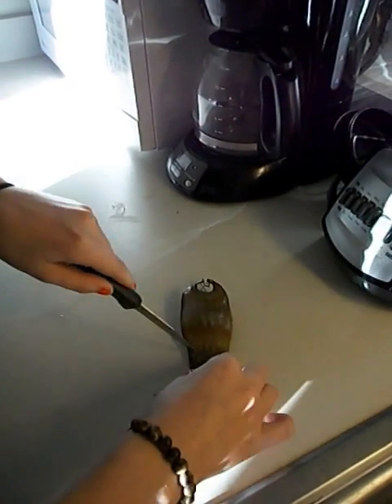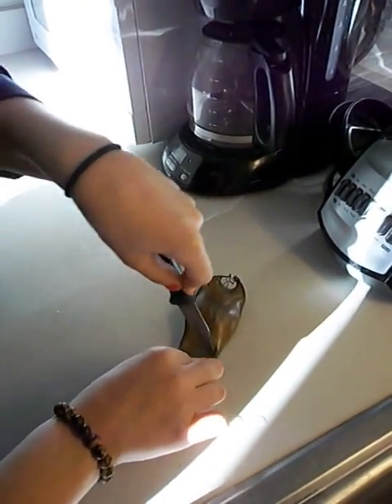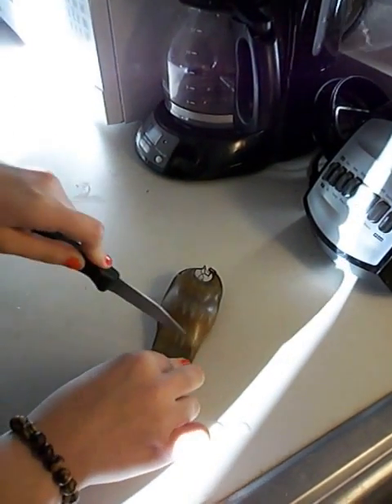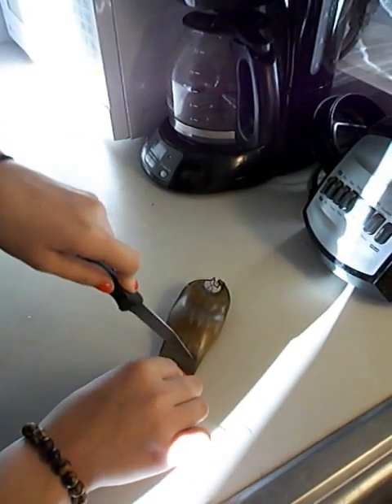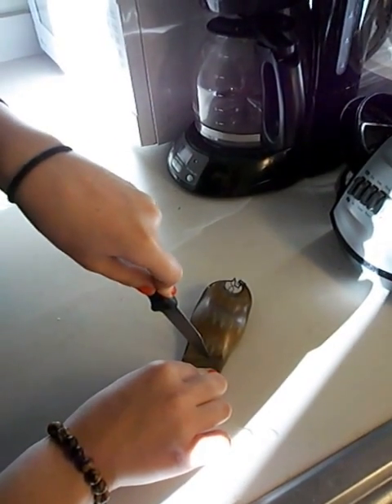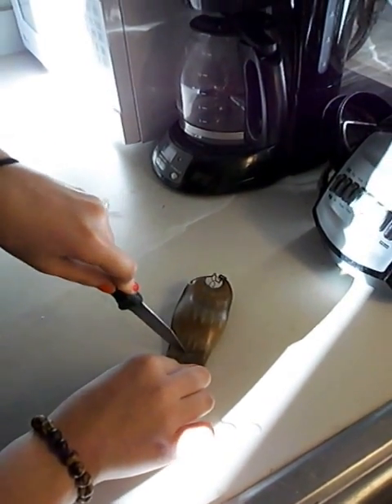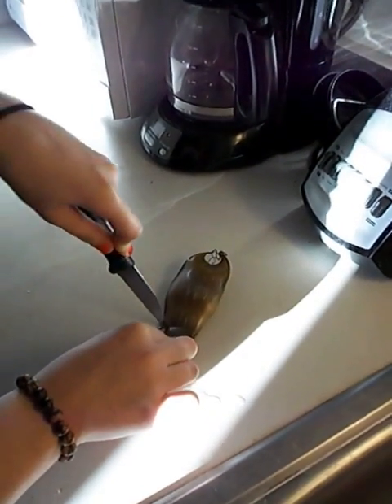Oh, this is really hard. Ew, that's gross. Oh my god, this is like — got it. Some tough stuff. So there we go. Let's just cut right through there. Got it — alrighty.